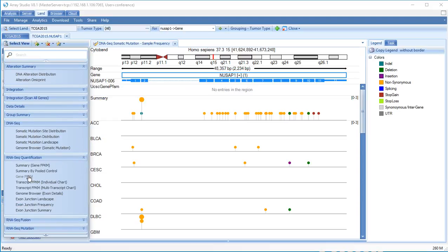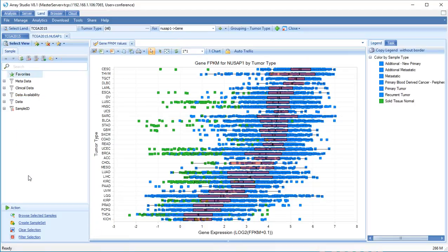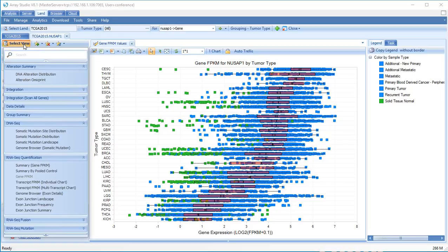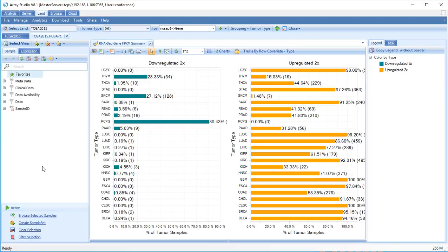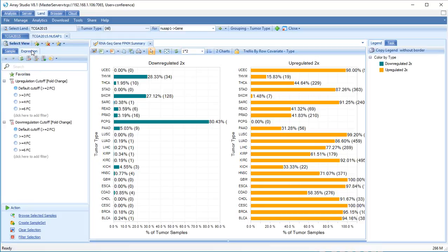The gene FPKM view shows gene expression levels in each sample grouped by tumor type and colored by tumor versus normal. The summary FPKM view shows the frequency of our gene of interest being up or down regulated in each tumor type. Cut-offs for up or down regulation can be changed under the Expression Filter tab.